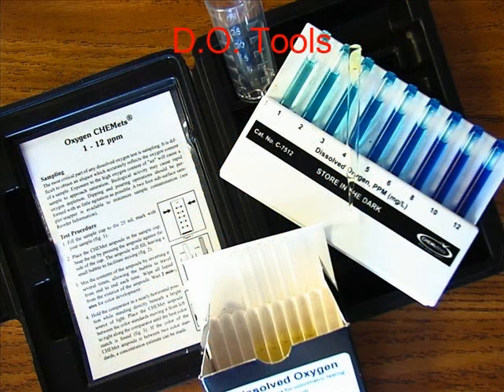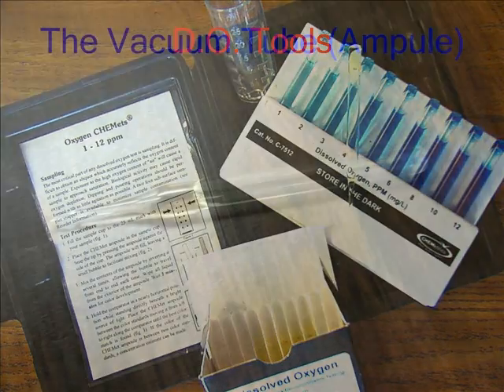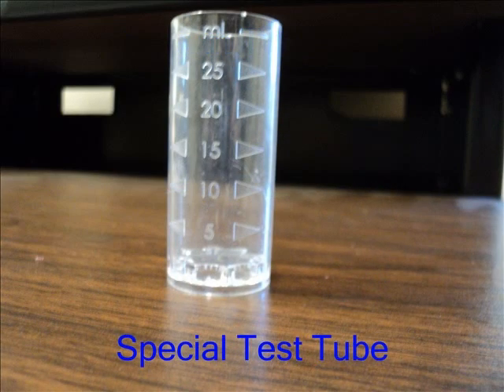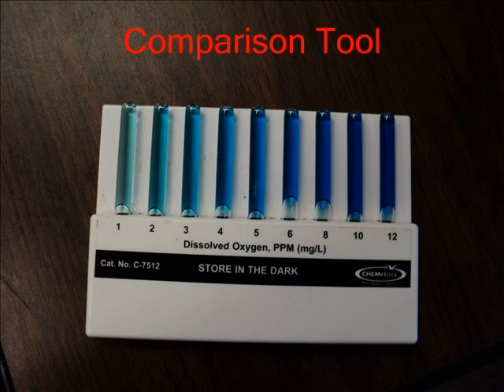How do you find out how much DO is in the water? DO is measured in something called ppms, or parts per million. To test, you need the right tools. The tools you'll need are a test tube designed for DO, special vacuum tubes, comparison tool, and of course, stream water. This is the vacuum tube, also called a vacuum ampule. The test tube, created just for DO. The comparison tool, necessary for DO testing.